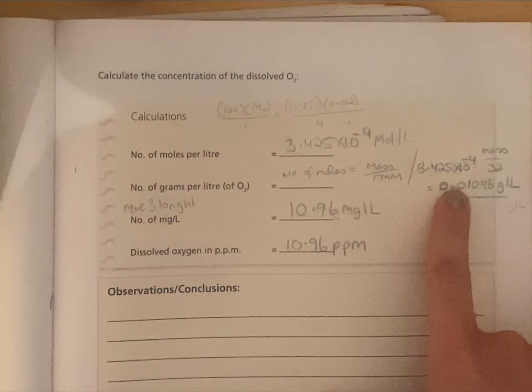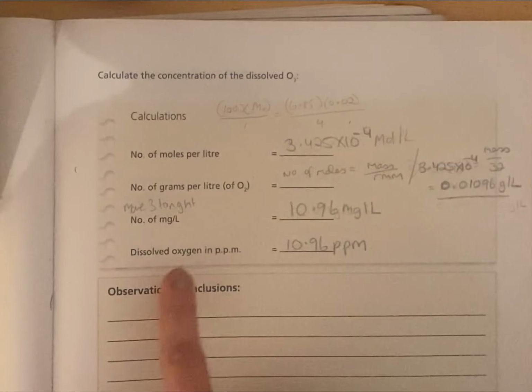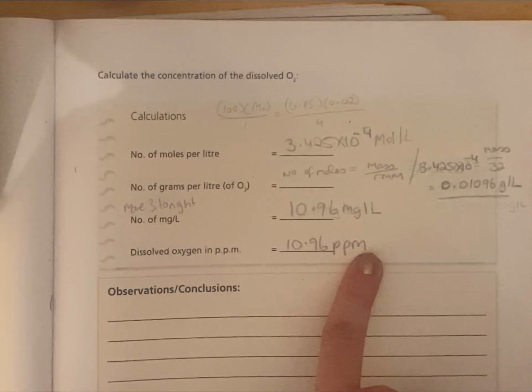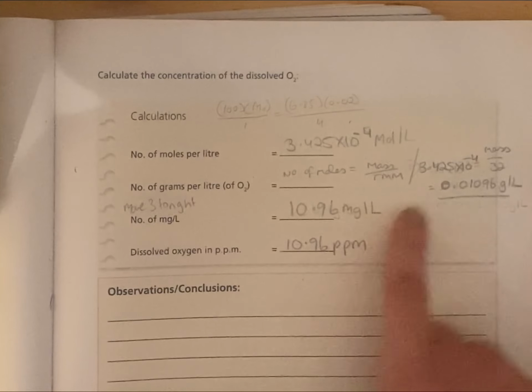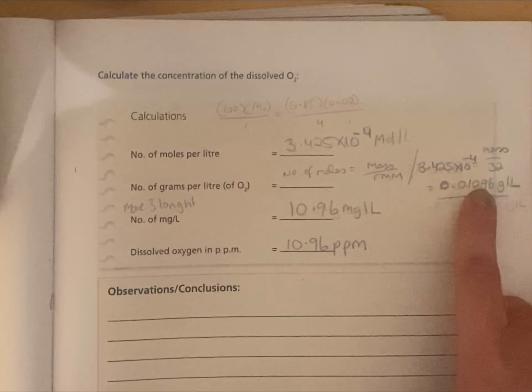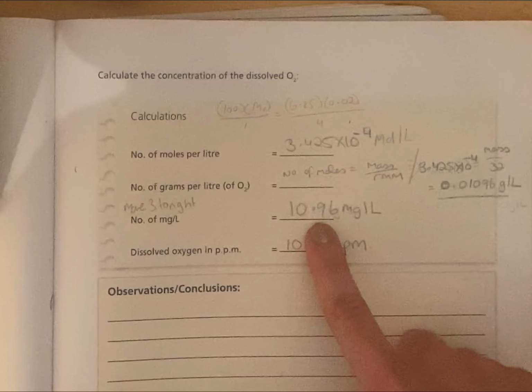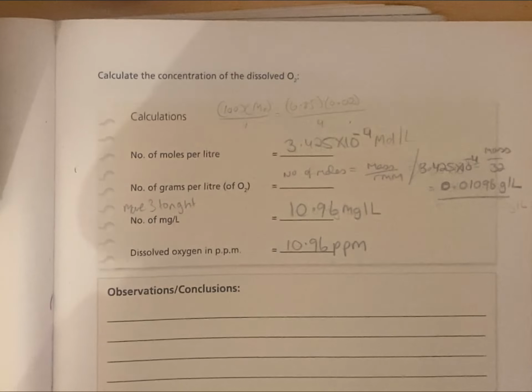I got 0.01096 grams per litre. It wants it in the end in parts per million. We know parts per million is the same as milligrams per litre. To convert grams to milligrams, move the decimal place 3 jumps to the right. So that is going to be 10.96 milligrams per litre, or 10.96 parts per million. And that's the amount of oxygen in your water sample.